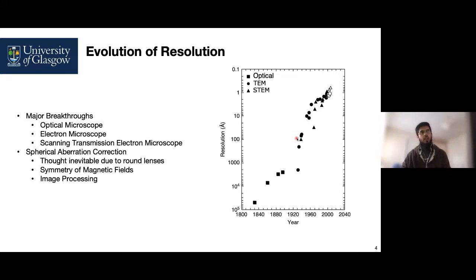And then around 1955, we also see another switch or change in the science or principles of microscopic techniques. Then with the emergence of the scanning transmission electron microscope, we again see a shift happening in terms of the resolution capabilities that we have these days.